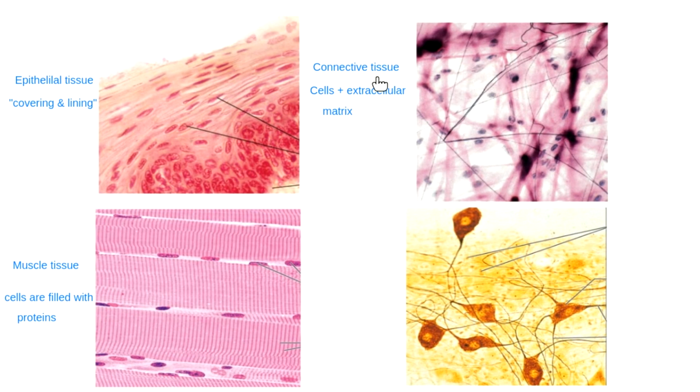So connective tissue, the big way you're going to identify it is you will see cells inside of it, and then you're going to see a bunch of stuff on the outside of the cells. Some of that stuff on the outside of cells is a lot of different proteins. But you might also see other things: outside of my bone cells, there's calcium. Outside of my cartilage cells, we have something called chondroitin sulfate. You'll know that later. You don't have to memorize that now.